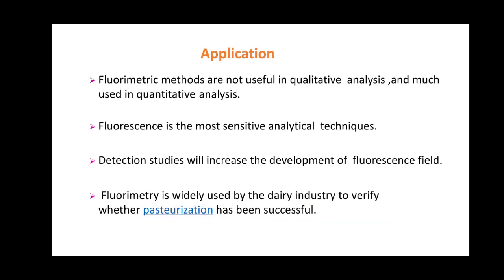The applications of fluorimetry: it is not useful in qualitative analysis but is used in quantitative analysis, and fluorescence is the most sensitive analytical technique, with high sensitivity and specificity. Detection studies will increase the development of the fluorescence field. And fluorimetry is widely used by dairy industries to verify whether pasteurization has been successful.